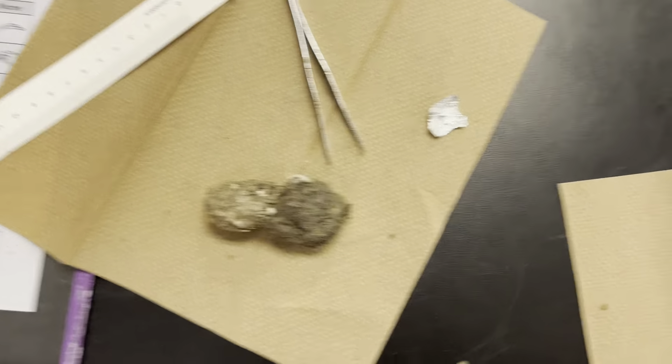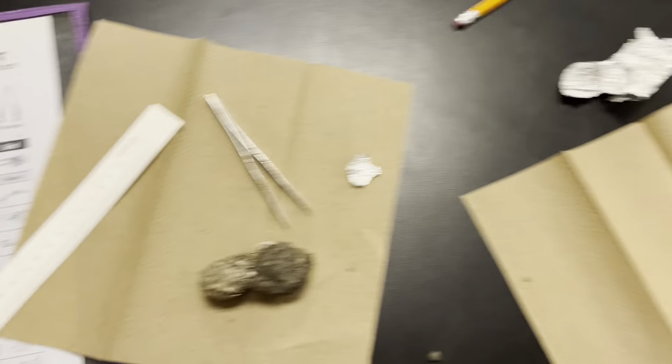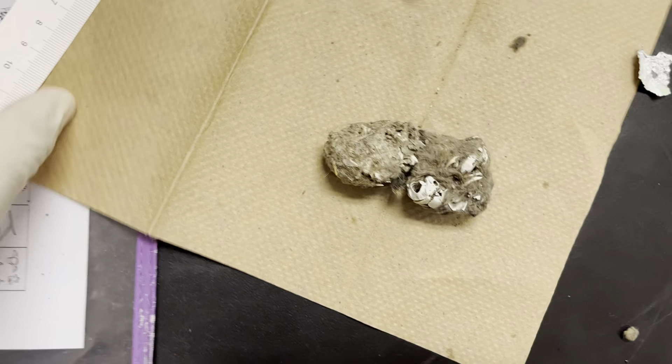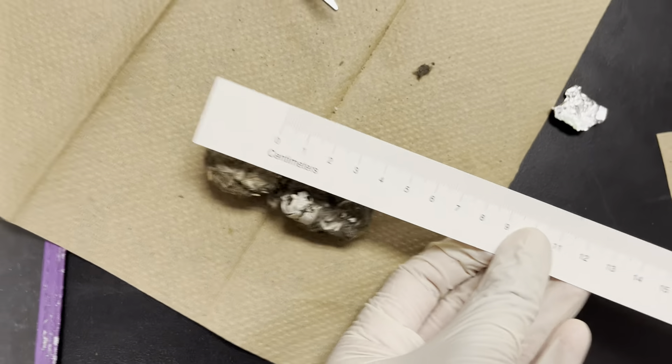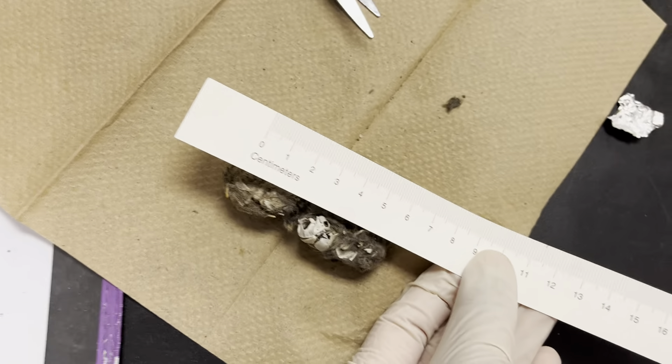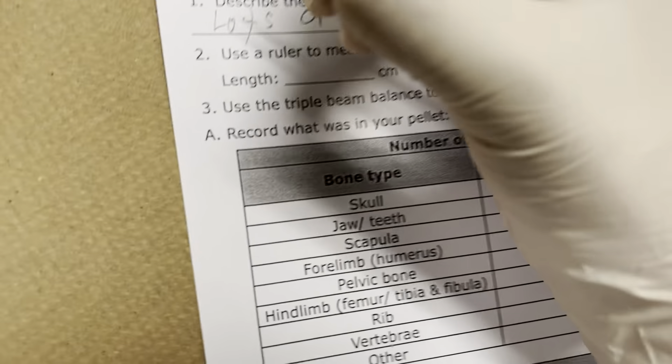What's up guys, welcome back to my YouTube channel. We are doing owl pellets today. We already took it out of the foil. Ours weighs eight grams. It broke apart when we saw it — we gotta put it back together. I kind of messed up the skull. Get behind your table. That measures about six inches — centimeters, centimeters.